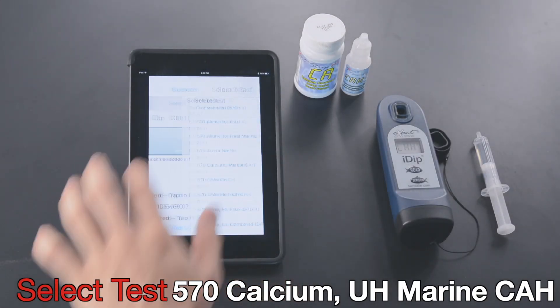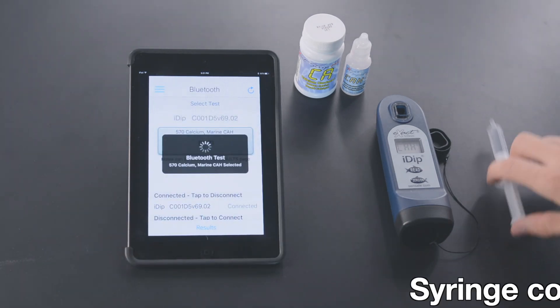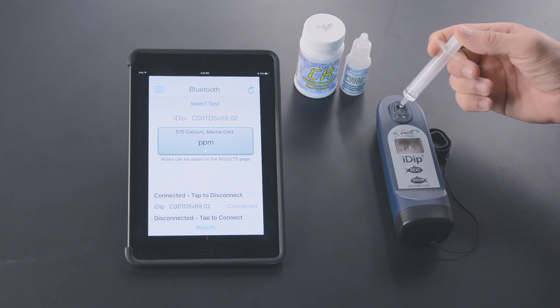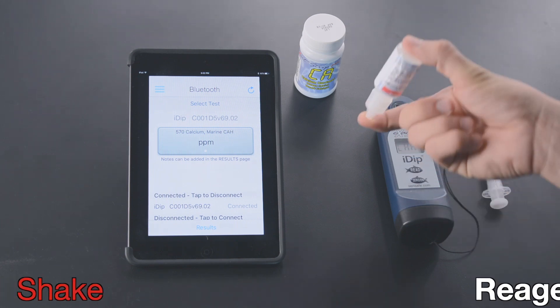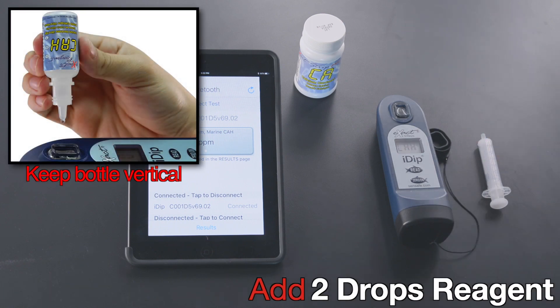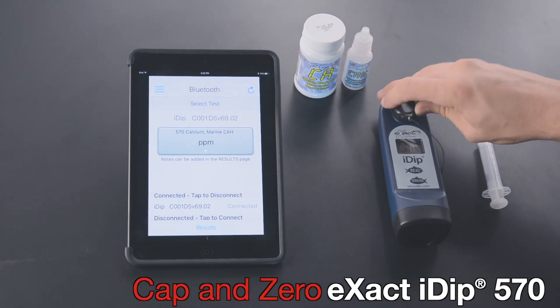Select Test. Add syringe content to cell. Shake reagent bottle. Add two drops reagent. Cap and zero Xact iDip.